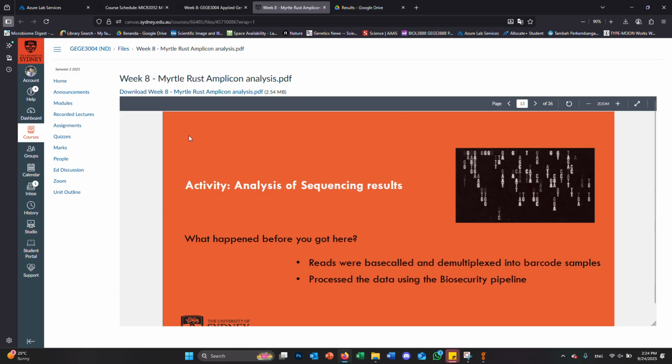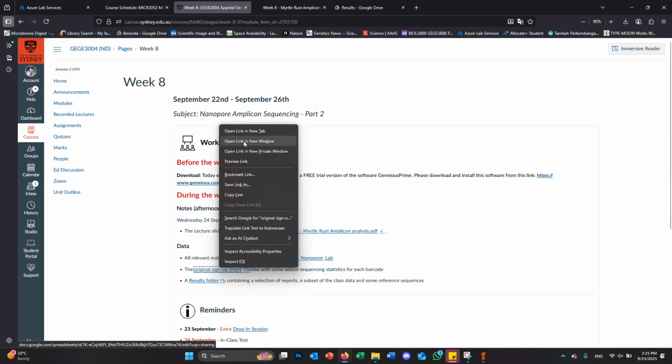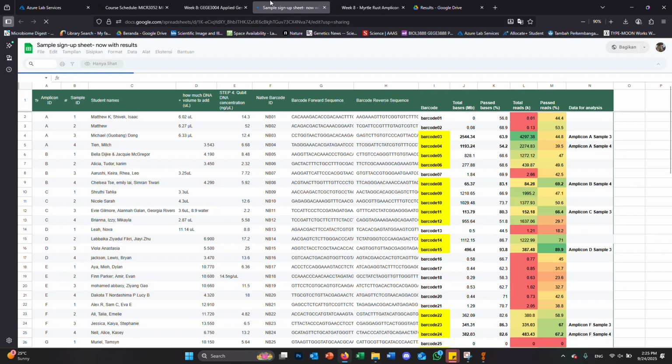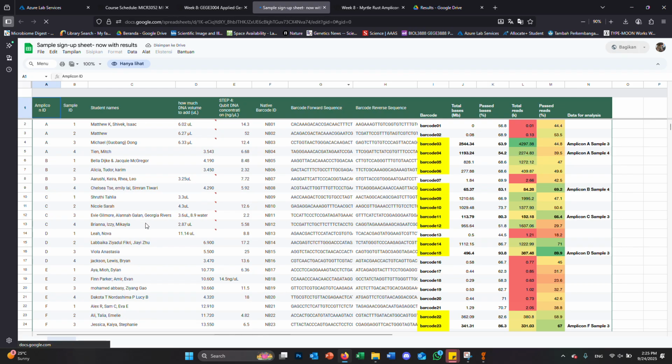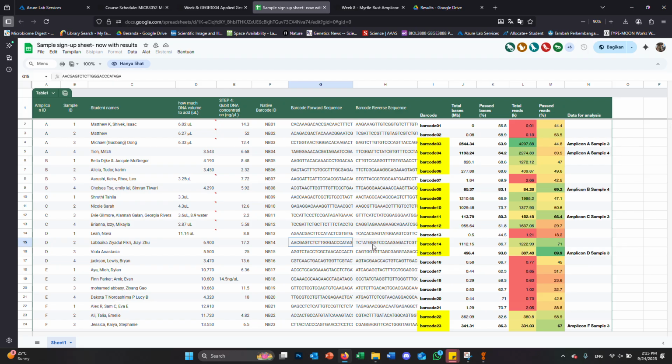This is barcode 26, works super well. But we're looking now here at a box and whisker plot. So what this is showing us, along the bottom, is the position in the read, so the base pairs of the read. The first 9 bases are labelled clearly, and then it kind of goes a bit logarithmic on us and jumps up to 1,500, 4,500, etc., increasing in size.